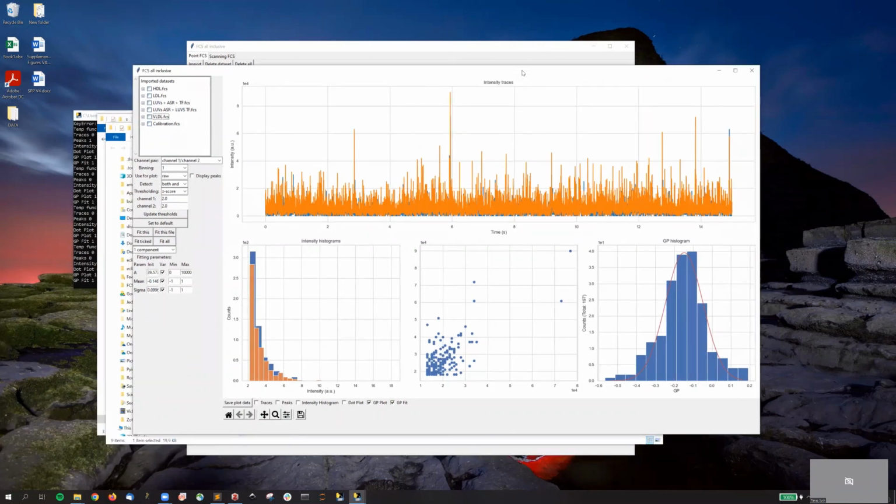If you want to analyze your data a little bit differently, if you are, for example, not happy with how your repetitions are arranged, and you want, for example, to create one continuous trace, you can use binning over here, which will just add all of your repetitions to one another.